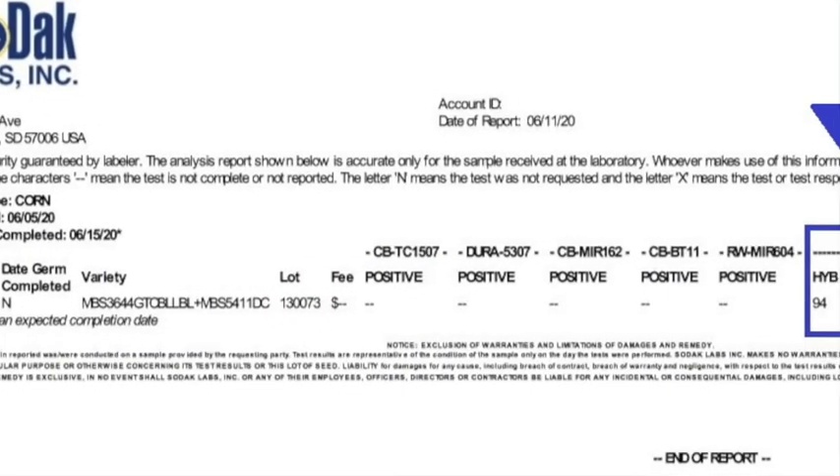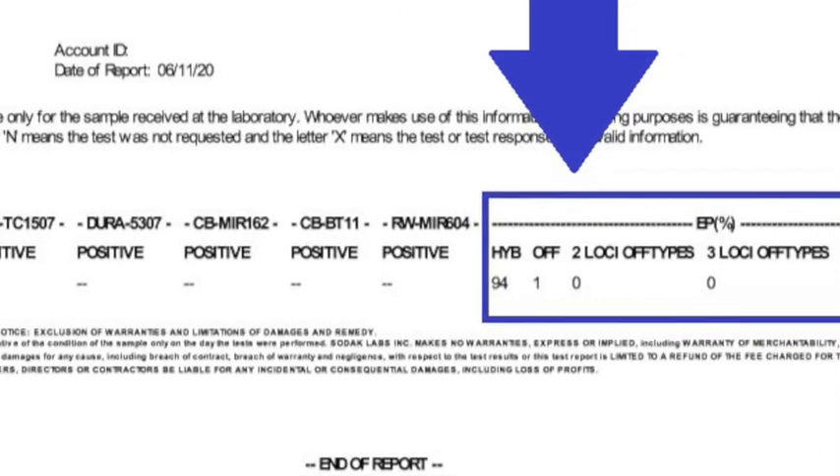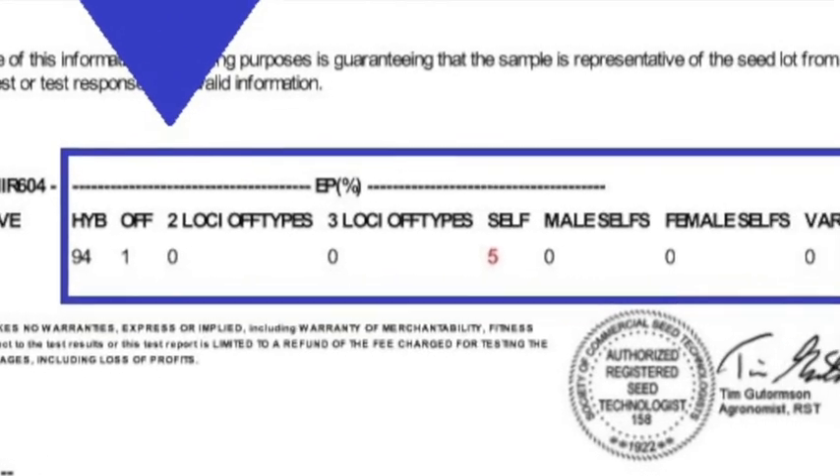We can also see variants, which is when a seedling has an unexpected pattern in only one stain. Once evaluated, the percent predominant hybrid, off types, and selfs are reported and can be accessed on our website at sodaklabs.com.